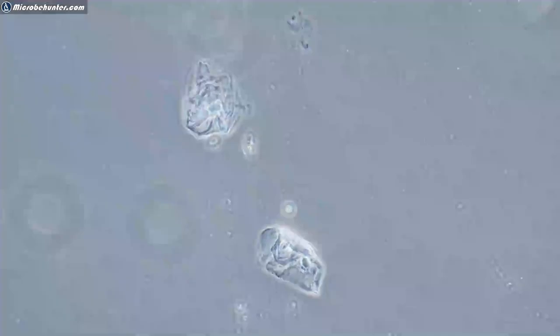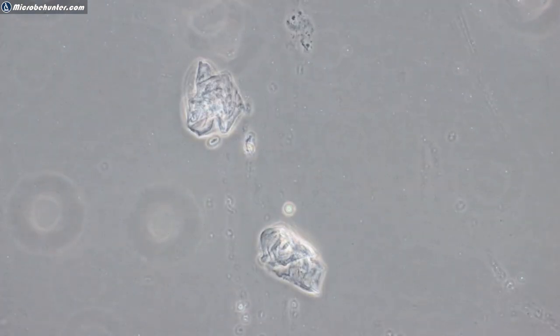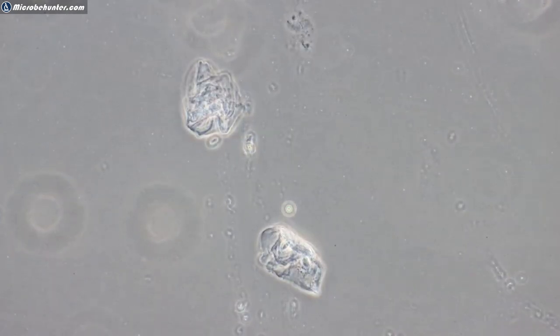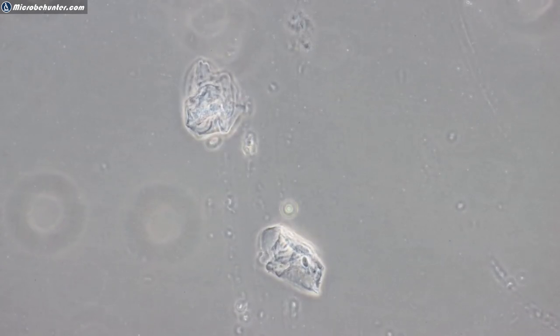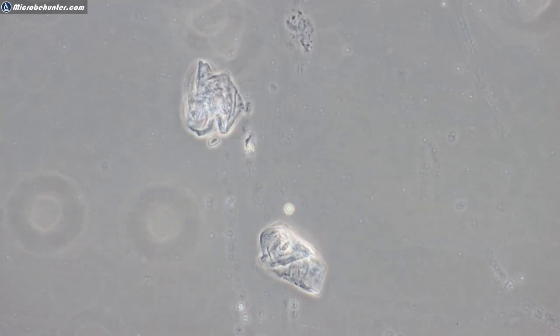And where is my phase, 40 times phase contrast. So, okay, rotate, and here is now phase contrast, okay? So you see again that it looks quite different. You will notice that the structures seem to have a bright halo around them. That's of course an artifact, but this is now basically 40 times phase contrast.